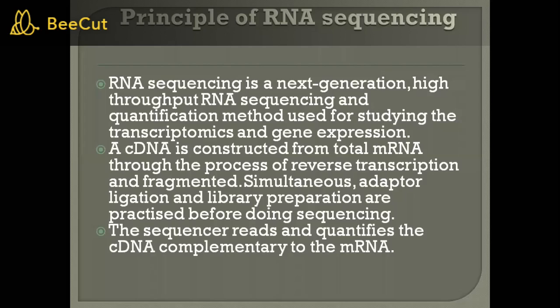For example, if we take a cell line, and we take another cell line with which we are going to find out the effect, the experimental condition is different in both. If we look at the genome of both cell lines, the genome may be the same, but the experimental condition differs: in the first cell line we add a drug, and in the other we do not. So the experimental conditions have a different effect on the gene expression.